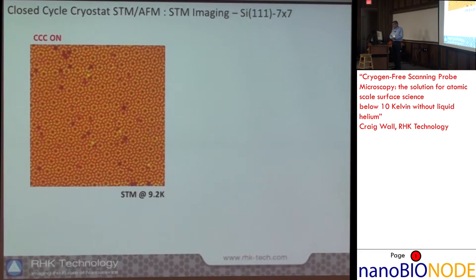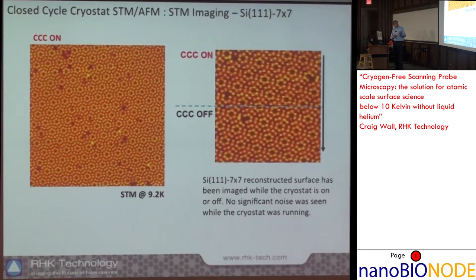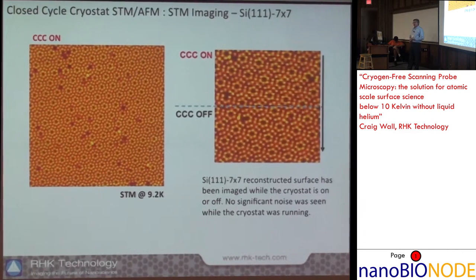This is an example of the silicon 7×7 reconstruction measured with the closed-cycle cryostat on at a sample temperature of 9.2 Kelvin. During the experiment, at the blue dashed line in the image, we shut the compressor off and turned off the closed-cycle cryostat. We can see there's no impact on the imaging — no dramatic change in thermal drift or noise.